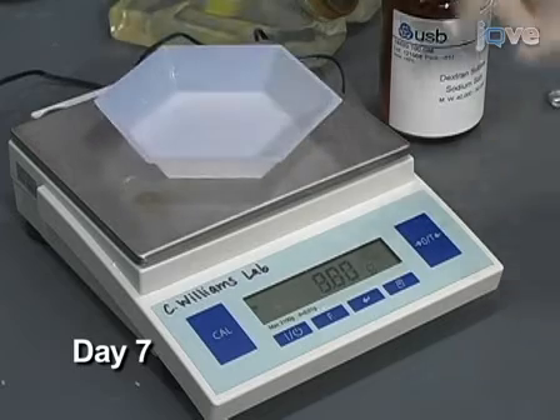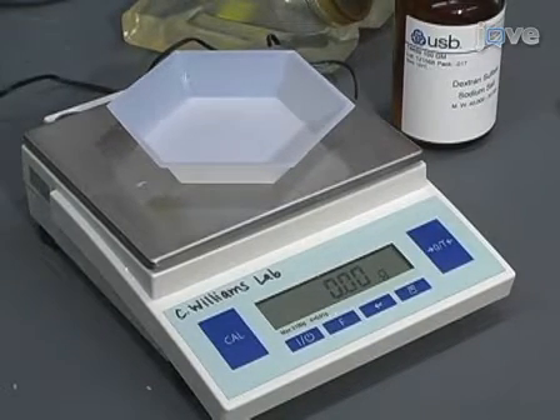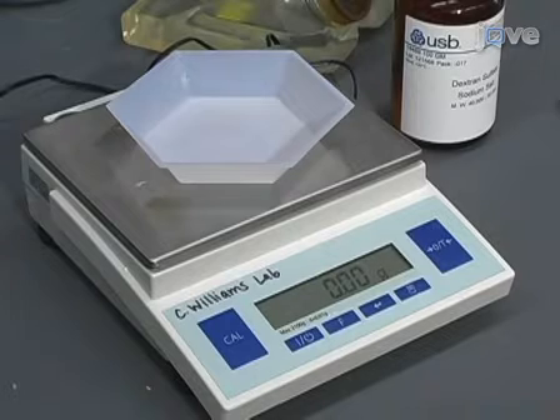Three days later, on day seven, the mice are weighed again. The colon can then be harvested from the euthanized mice, as shown in the next section.